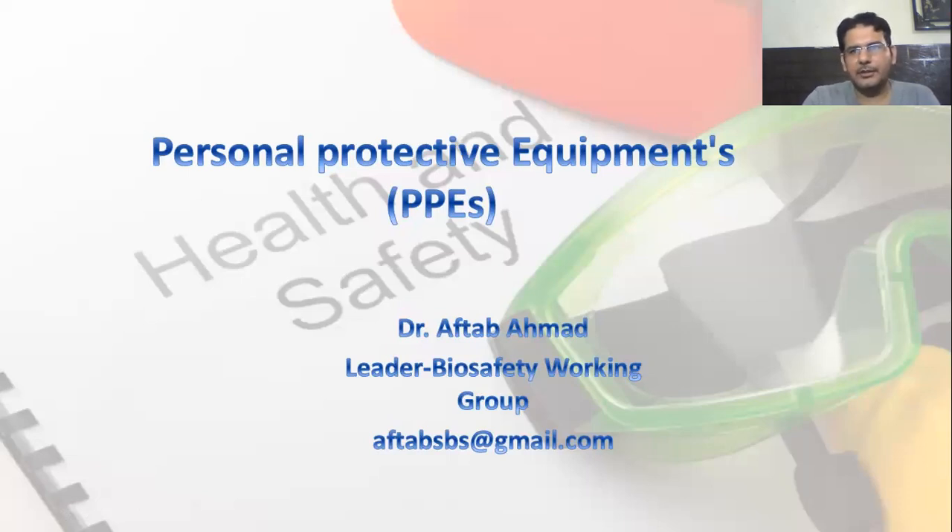If you are doing the practice, then you can do it very easily. In addition, it's also very important that you have a proper understanding of what PPEs are required in a particular experiment you are going to perform. For example, if you are working in a molecular biology laboratory or in an area of microbiology, then often we have to prepare buffer solutions, and in buffer solutions we have to prepare a solution of SDS, sodium dodecyl sulfate.